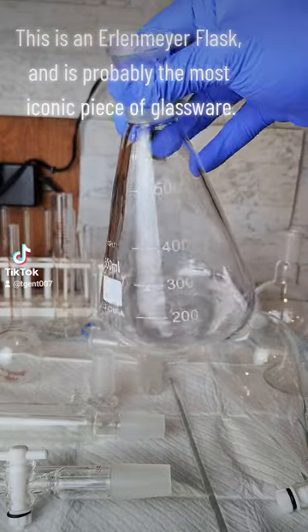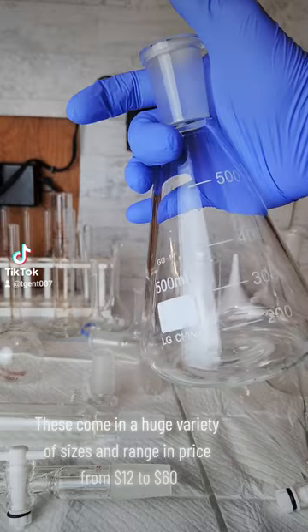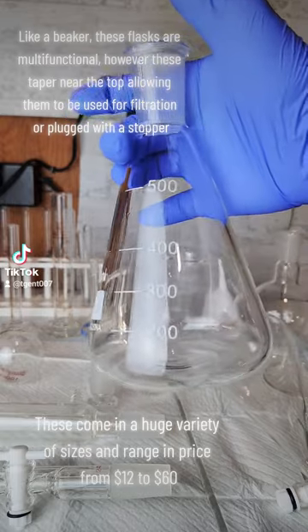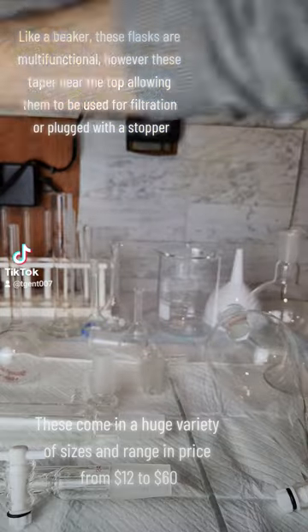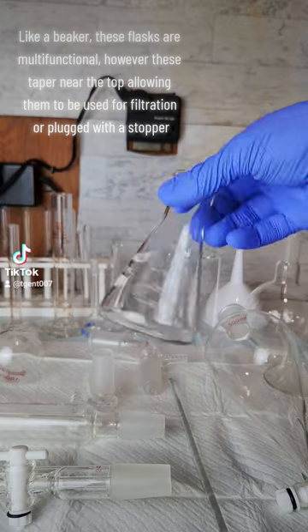This is an Erlenmeyer flask and is probably the most iconic piece of glassware. Like a beaker, these flasks are multifunctional; however, these taper near the top, allowing them to be used for filtration or plugged with a stopper.